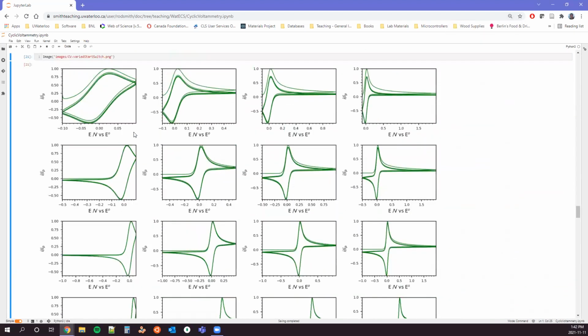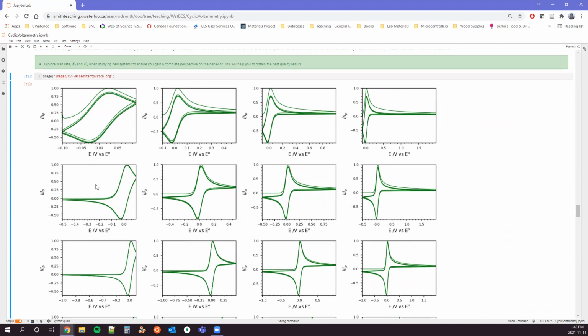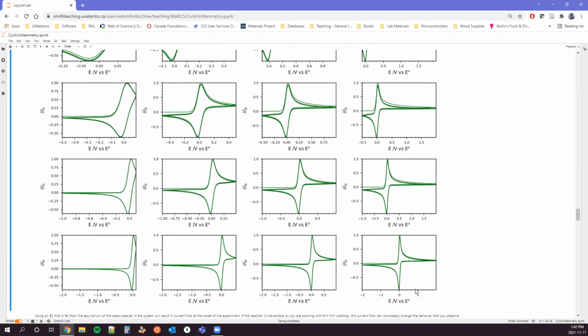What we're looking at is just a change in the initial and the switching potential systematically, right? As we go from left to right, we're going to change the switching potential. Our anodic turnaround voltage keeps extending out further and further and further. And as we go downwards, we're going to do it on the initial voltage. We're going to start from more of a negative value as we go. What we can see is in these extremes, when we let the system go for so long that we're basically beginning to approximate bulk solution, we see quite stable behavior.